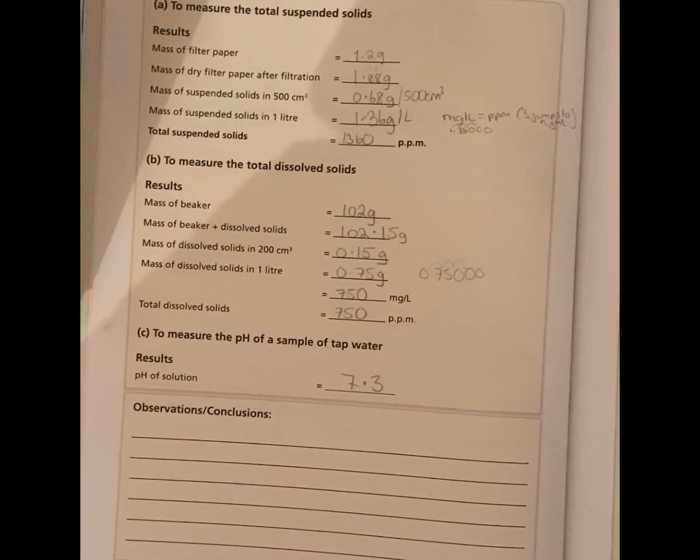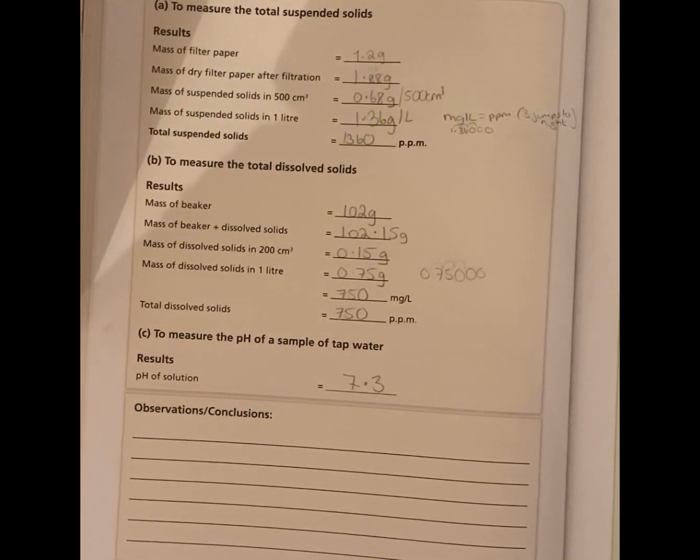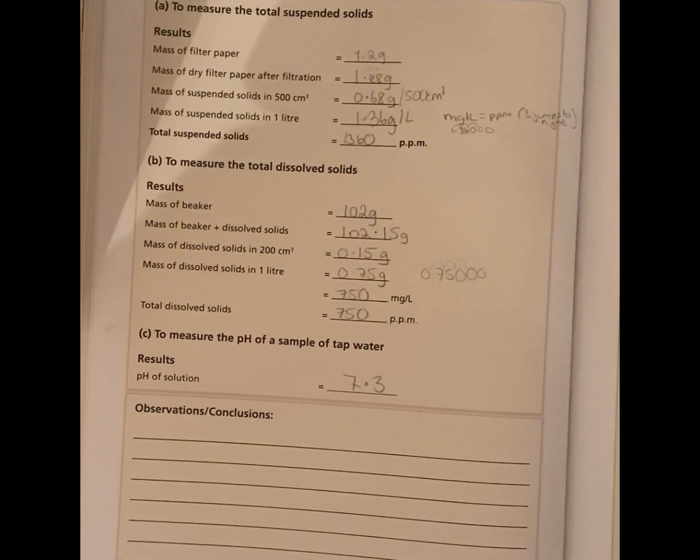Then the standalone part C is just the pH meter. So you would have put that into the water and taken a reading, and it should be around about 7. So 7.3 is what I got.